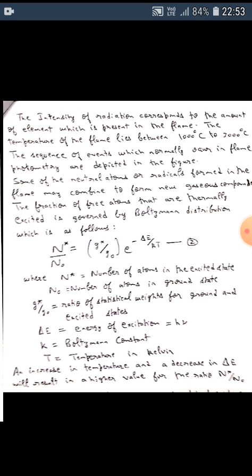A portion of the neutral atoms or radicals formed in the flame may combine to form a new gaseous compound.